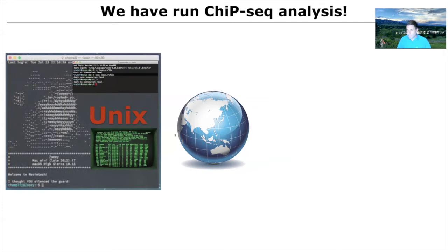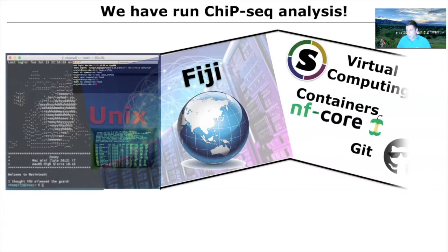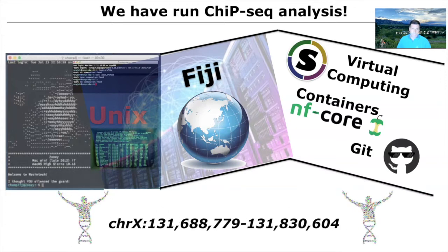You have now, in the previous class, just run your first ChIPseq analysis, which is fantastic. And so now what we want to do is give you some background of what all was run, what programs were run, and the pipeline that Nextflow put together for us. And a little more background about what the biology we're going to start to explore is, just to give a context now that we've run the data, what are we looking at, and get back on the same page. Towards our goal of doing a much larger ChIPseq data set.